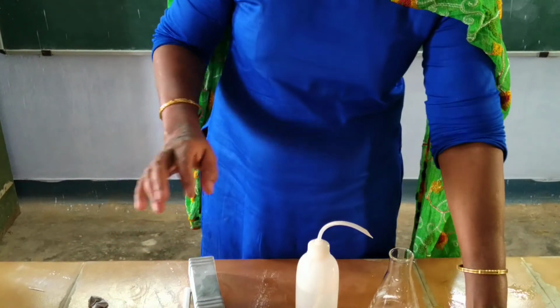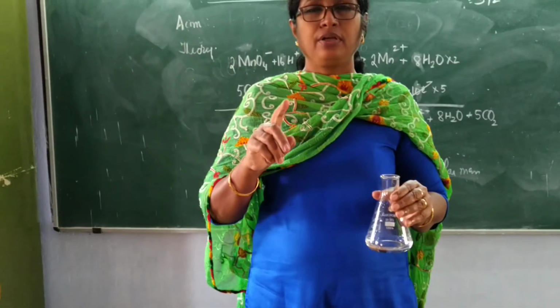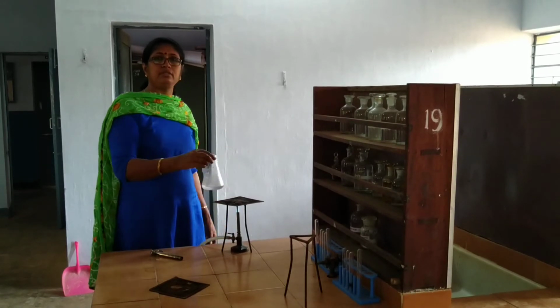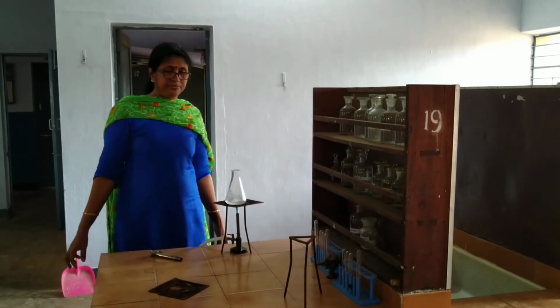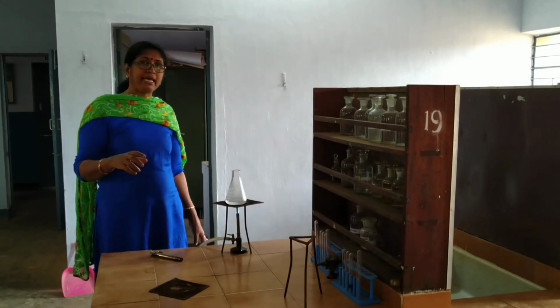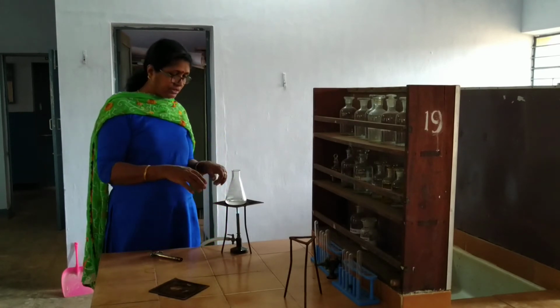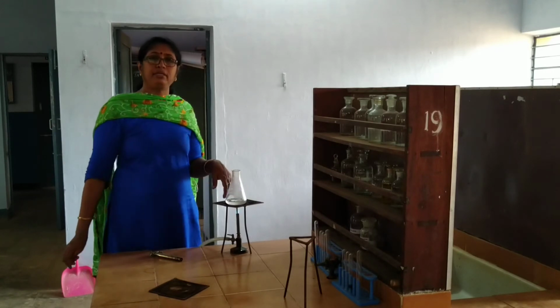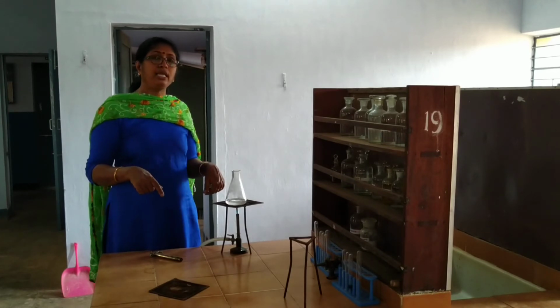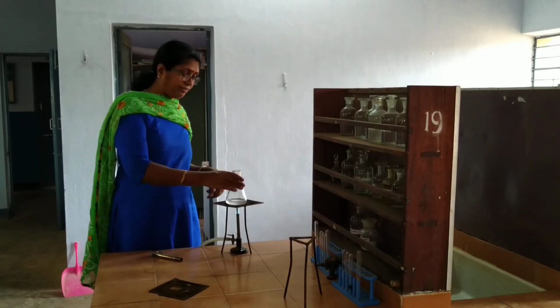Now I told you it requires activation energy. You will have to heat it. I told you, you will have to heat it till the heat is unbearable on the back of your hand. So you heat it for some time and see whether the temperature is bearable, because you will have to titrate it. The solution should not boil, because if it boils it will dissociate. You will have to be very careful when you are heating.